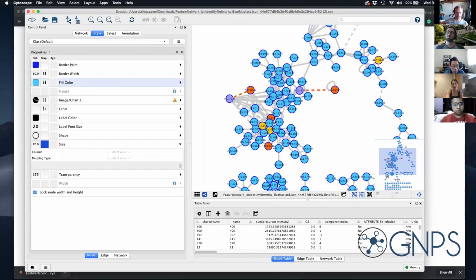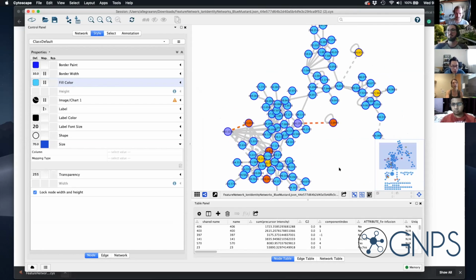So yeah, I think for now that was pretty much what I wanted to cover for Cytoscape visualization. I think you get a pretty good picture of how if you organize and color code your network, you can actually visually inspect it, and the siderophores present in this data set really just start to pop out of the page, and it's very obvious to find them.